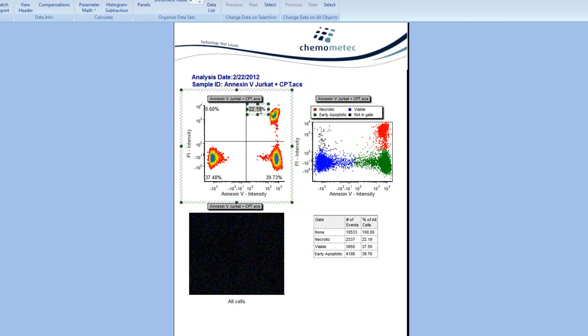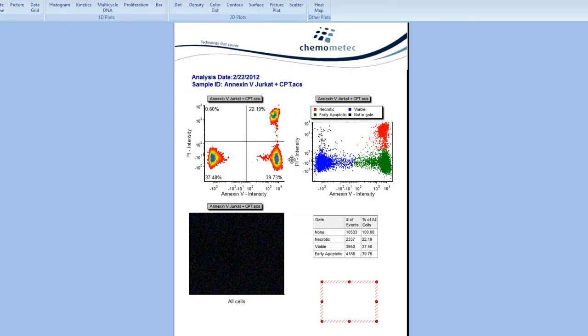And what this lets us do is these tokens, if I want to insert a text box, we can actually grab these tokens and drag them anywhere else in the software into a text box. And we can say the upper right quad % is, and then we have a text box describing what that quad percentage is.